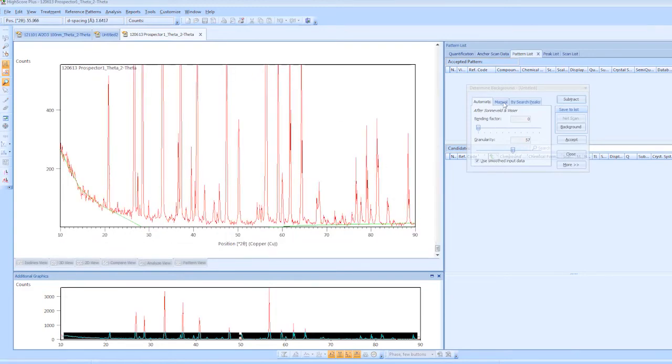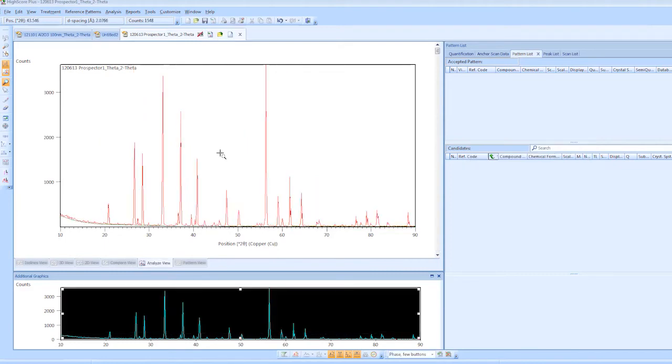And again, I'm going to do it manually, okay? So see how I said down here, it doesn't match really well? I'm going to add a point, and then move that down a little bit. This one down a little bit. Move that one down. See that. This one pops up a little bit. I'm going to move that one down here. Add another one right here. Okay, so I'm liking that, so I'm going to accept that. I'm going to go through this one without smoothing it, and then we're going to redo it, and you'll see the difference in the numbers after you smooth it.